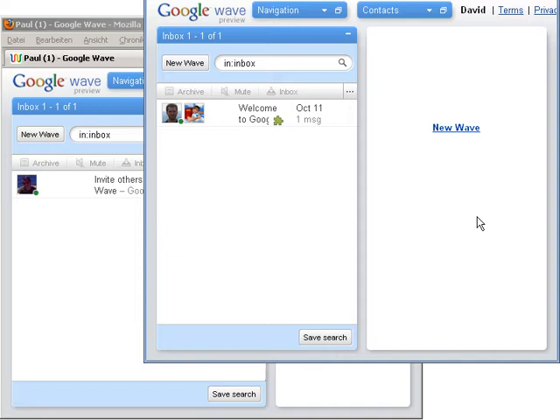Today we want to demonstrate a very early version of SynBioWave, which is a synthetic biology software suite based on Google Wave. Let's have a very brief introduction to Google Wave first, because many of you might not have seen it yet. Wave is a communication and collaboration tool by Google, which will be released in a couple of months. The idea was basically to kind of reinvent the email. And Google Wave is a web application which has impressive features like real-time editing and multi-user conversations.